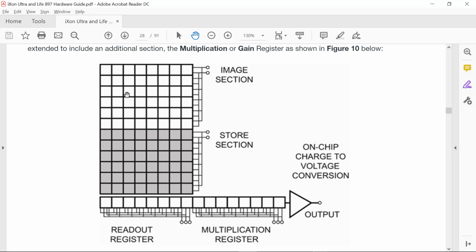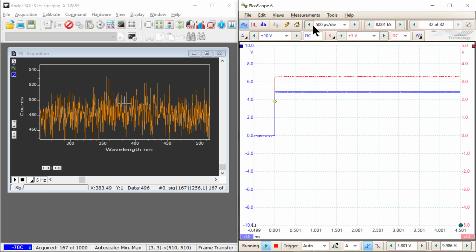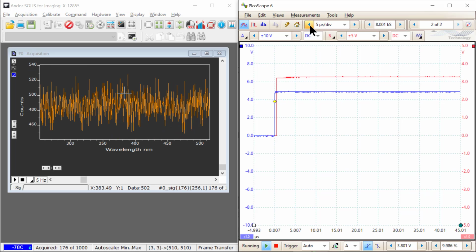But then once that is finished, it goes to the next frame, and subsequent frames don't have a keep clean cycle, because as I mentioned, it's pretty tightly coupled: in between your exposure, you're shifting that down into this area, and then you're doing your next one. So there's not really a lot of room for additional cleanout cycles, nor necessarily might you want them. After that first one, things should be happening pretty quickly. So let me go back here, and you can see that the actual gap in between the exposure and the trigger and the fire signal is pretty small.